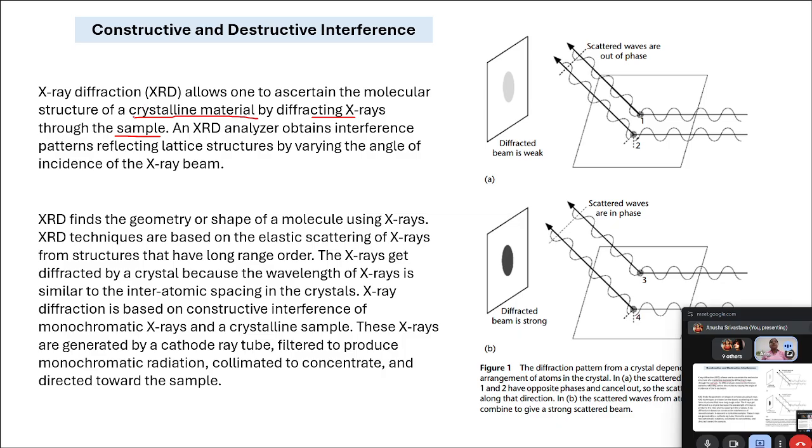So whenever we have a crystalline material and you want to ascertain its structure, suppose you have a plant extract, right? And you intend to make metallic nanoparticles, suppose copper nanoparticles, silver nanoparticles, or gold nanoparticles, right? Now you have the plant extract, you can record the XRD of this one, and then you can record the XRD of these nanoparticles in order to actually understand if you have achieved this or not.